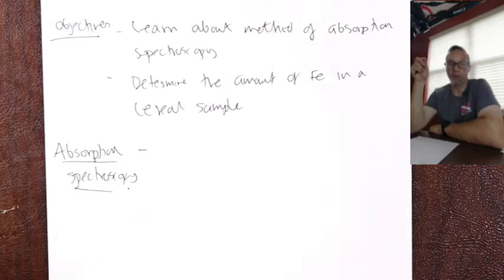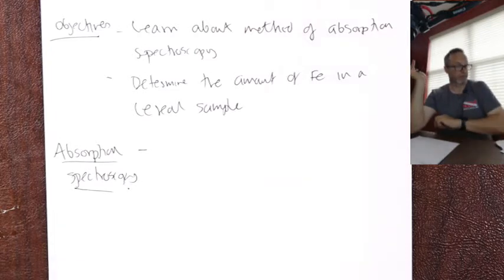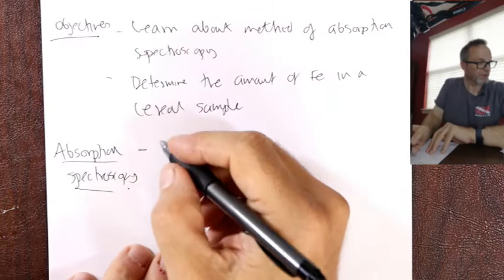The more ions are in the way of the light, the more it absorbs, so the more intense the color. So it's a simple observation: the deeper the color, the more ions in the way. That's essentially called Beer's law. We can relate absorption, which is really how many ions are in the way, to how much light's absorbed. So let's do a little picture here.